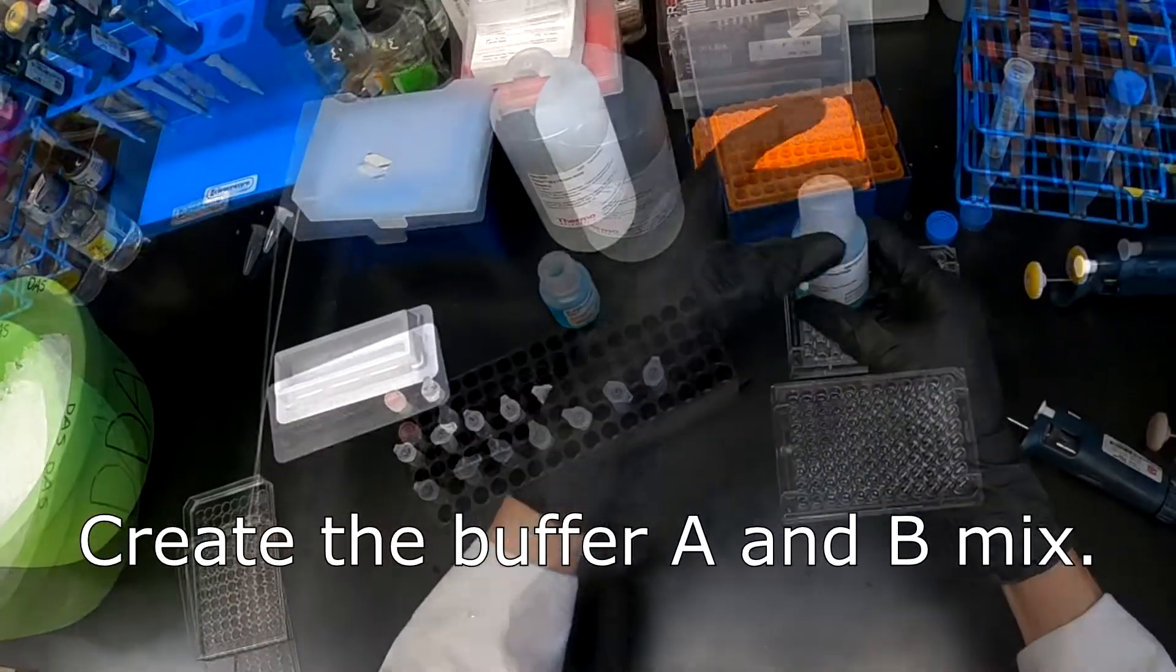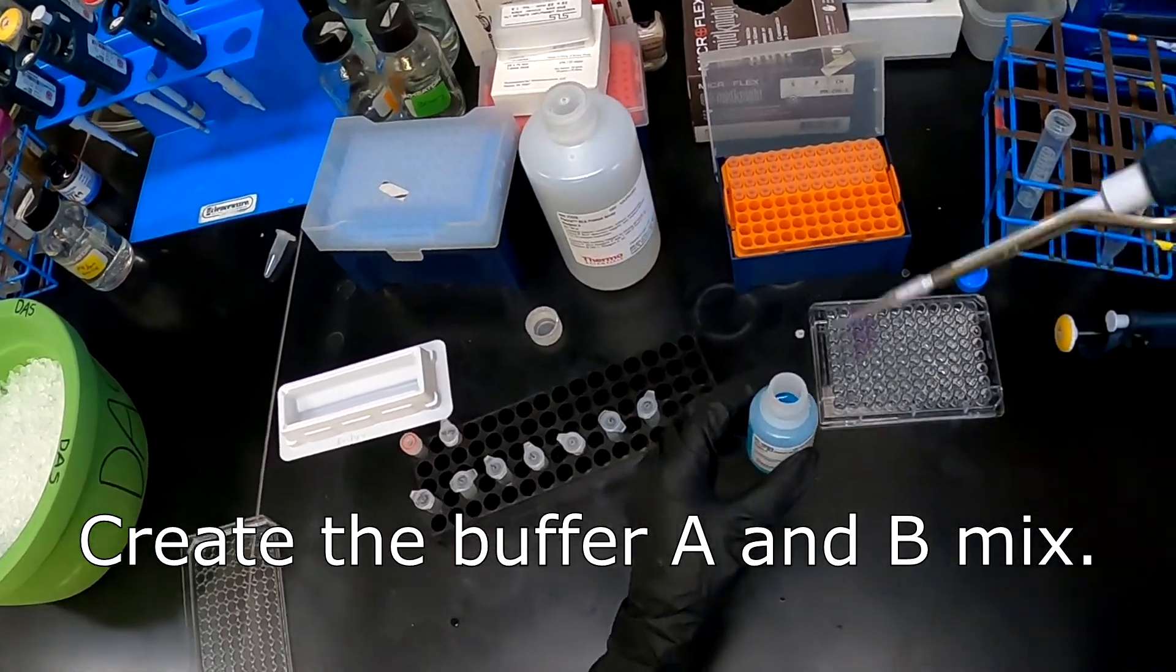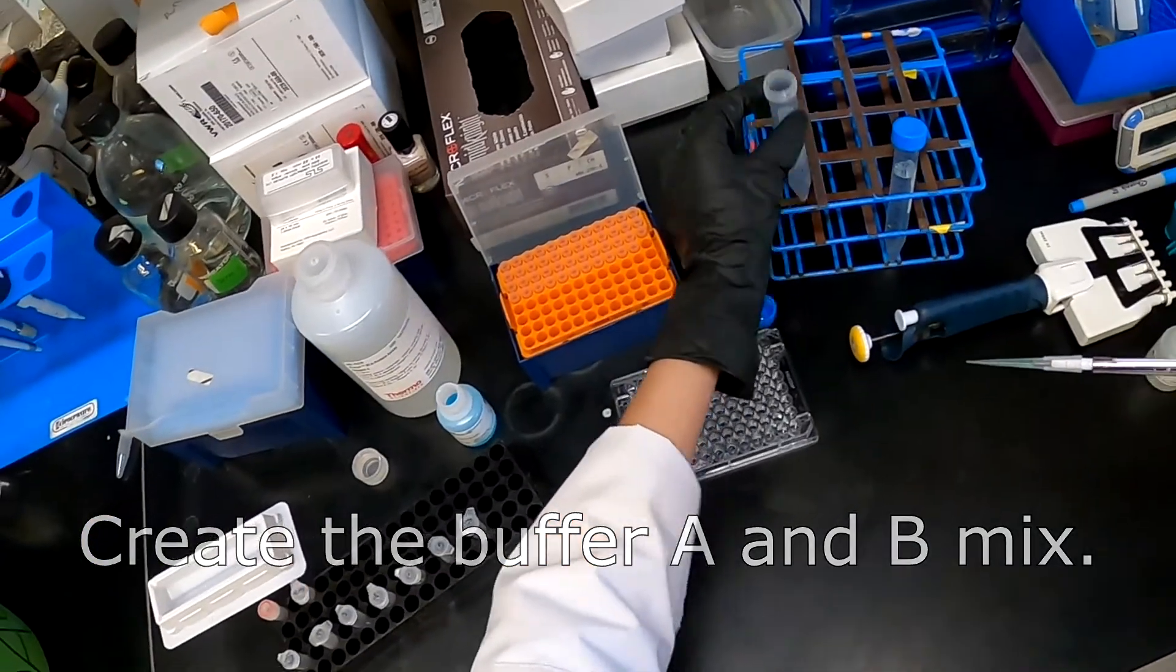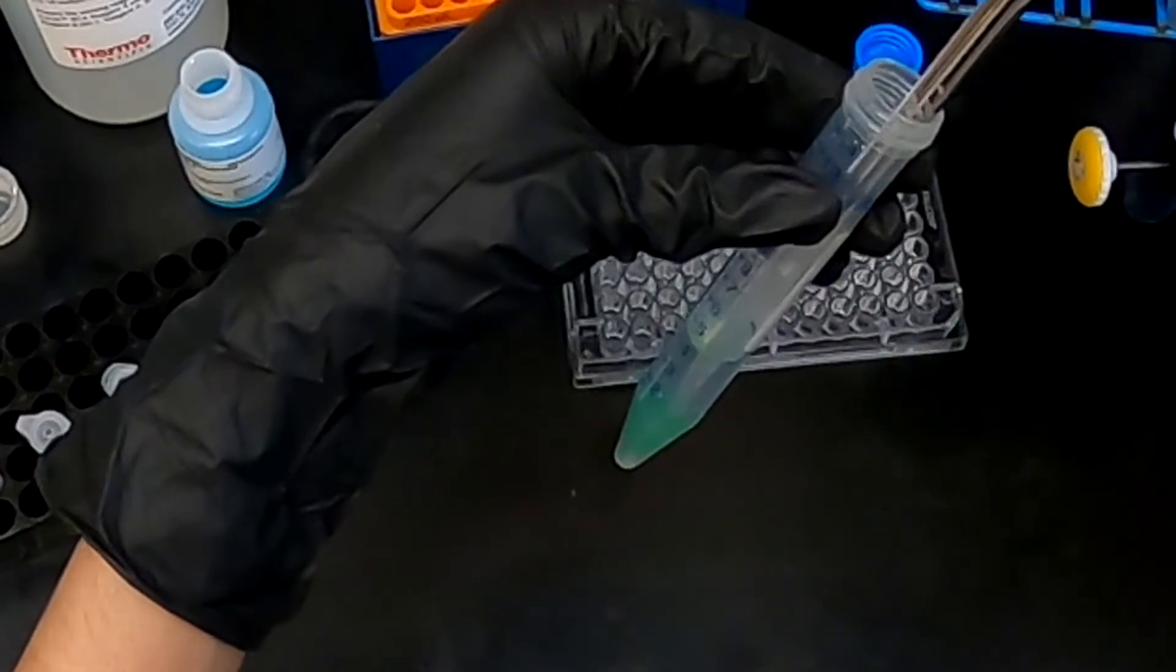The working reagent has to be mixed in order for it to be usable. It consists of a 50 to 1 dilution of buffer A and B. 200 microliters of this working solution will then be placed into each well of the plate.